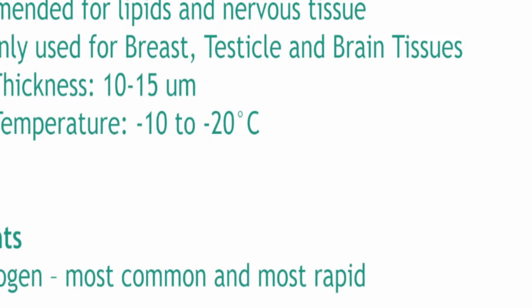Okay, so freezing agents that we use: liquid nitrogen. This is the most common. Yan yung pinaglalaruan ng mga students ko dati nung naglalab pa ako sa Pilipinas. Lalagyan mo ng tubig tapos uusok. And other ones, normally they don't ask this in the board exams, but just for reference, you guys add it to your notes. They use isopentane, carbon dioxide gas, and aerosol sprays.